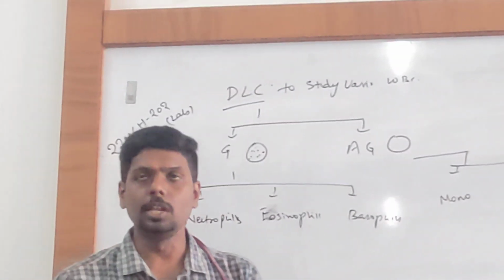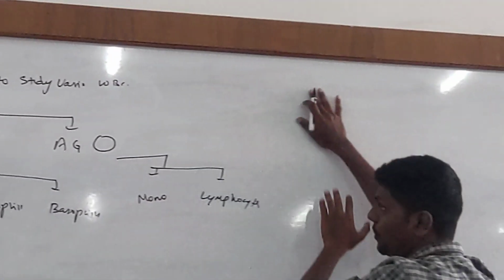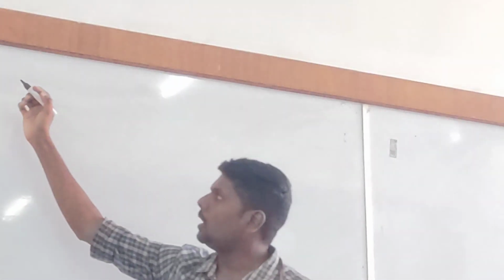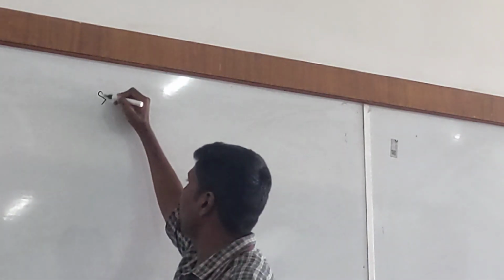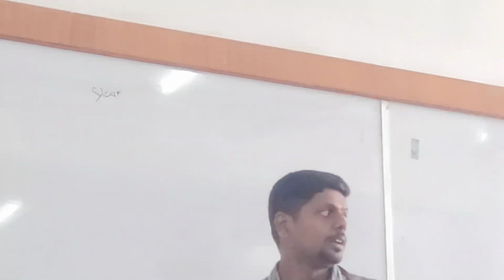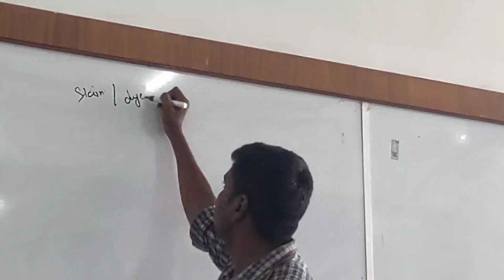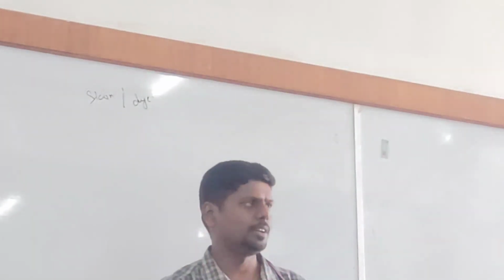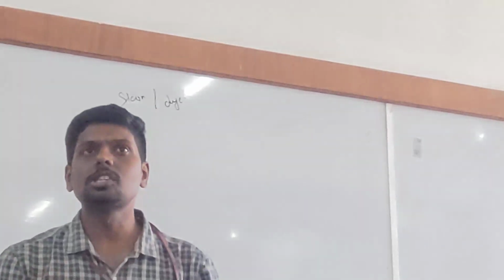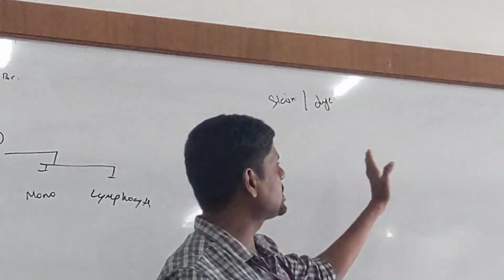Now listen very carefully. I just want to add some more fundamental topics, then we will connect everything. So, the theory of staining. I want to talk about stains. What is the difference between a stain and a dye? What is a dye? Can you define it? Anything that gives color is called a dye. Am I correct? So, what is a stain?